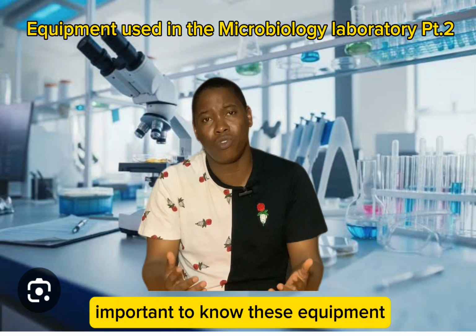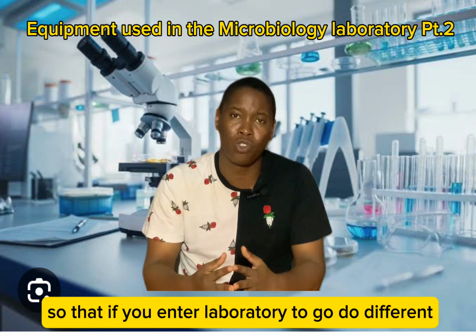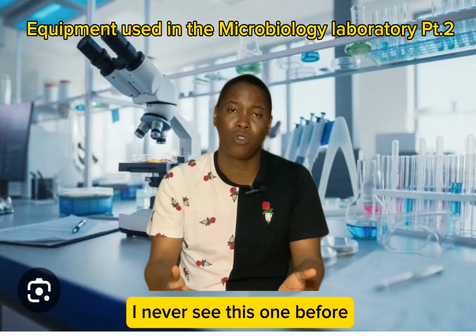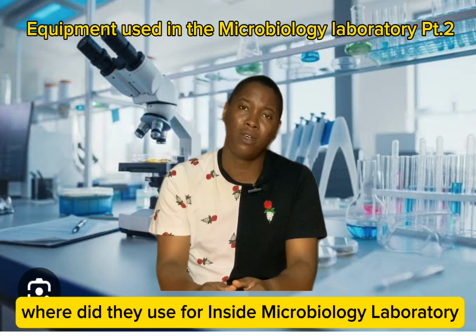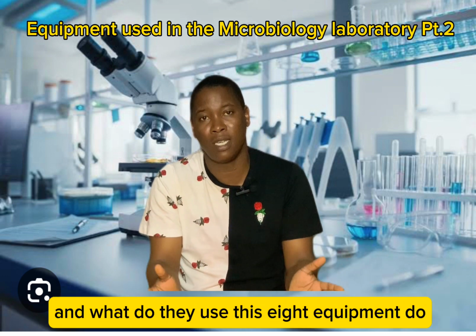And it's important to know this equipment, understand these different equipment, so that if you enter laboratory to go do different experiments, you no go dey surprised or you no go see any equipment and say, I never see this one before. Now for this video, we will just take 8 of the equipments wey they use for inside microbiology laboratory, discuss these 8 equipments and wetin we dey use these 8 equipments do.